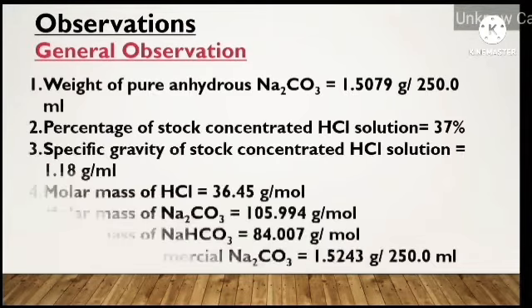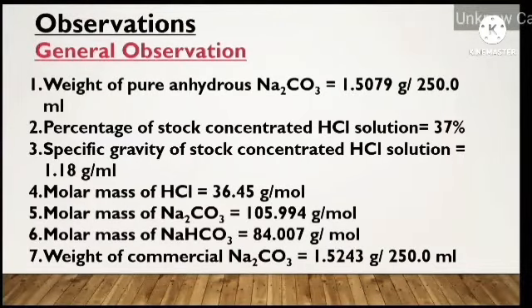These are the journal observations. The weight of pure anhydrous sodium carbonate obtained is 1.5079 gram per 250 ml. The percentage of stock concentrated HCl solution is 37%. The specific gravity of stock concentrated HCl solution is 1.18 gram per ml, and these are the molar masses of these chemicals.